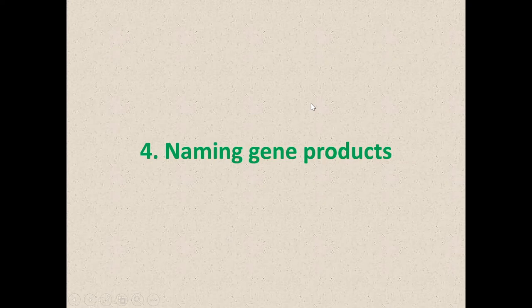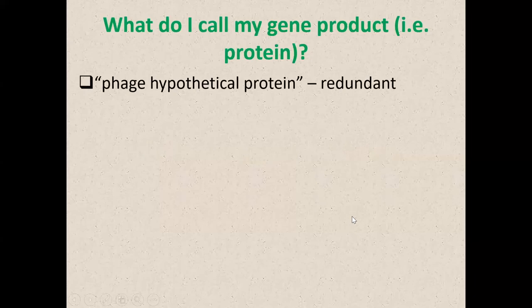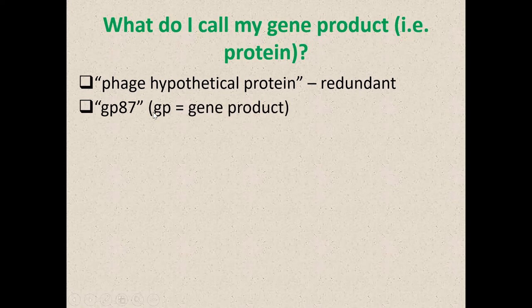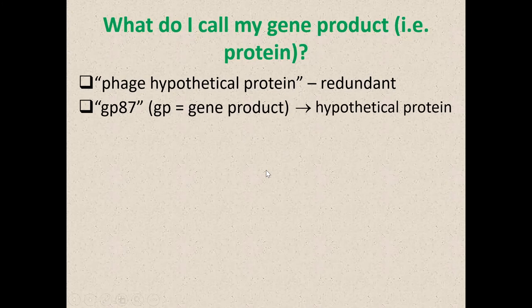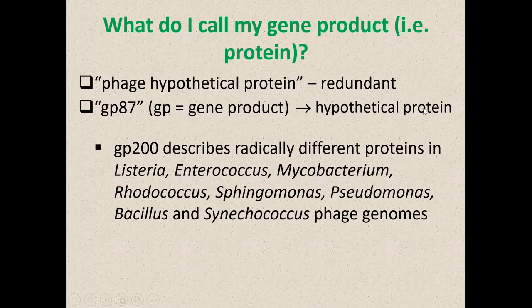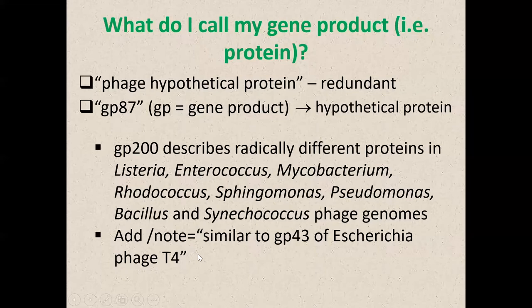Now we get to the point of naming these things. 'Phage hypothetical protein' or 'phage protein' is redundant — get rid of 'phage' and just leave it as 'hypothetical protein.' Many people use GP (gene product), but GP87 or GP200 means nothing. I searched for GP200 in the protein database and found completely different proteins across phage genomes. Please change these to hypothetical proteins.